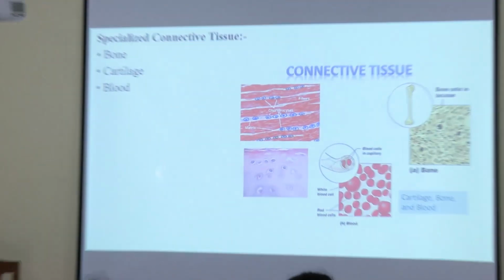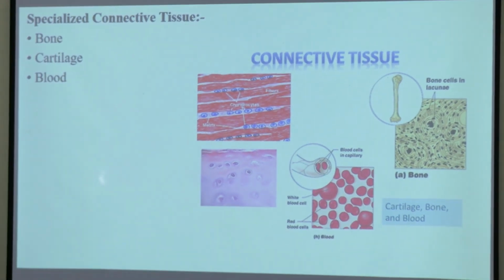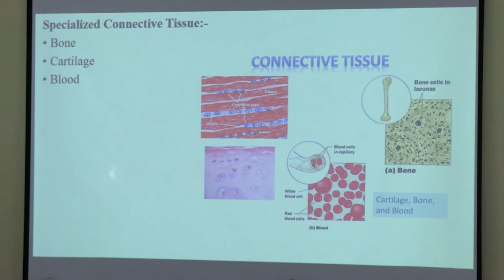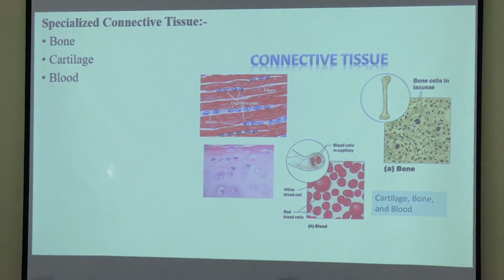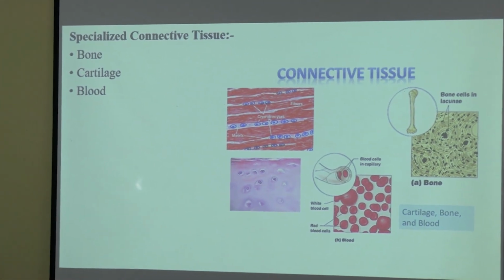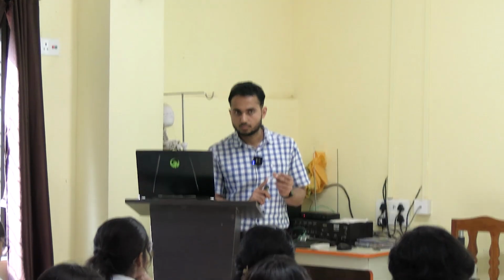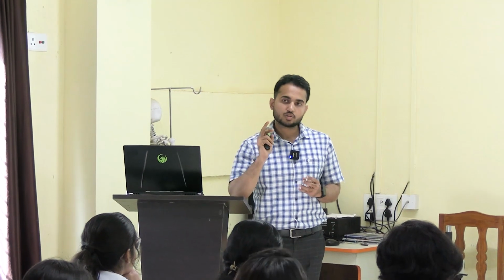Okay. Now, along with the cartilage, I will show you only one slide. I have only one slide of adipose tissue from the connective tissue, which I can show, and already I have shown you. Again, what you have to do is see it under the microscope.